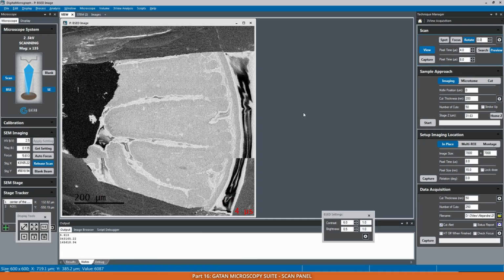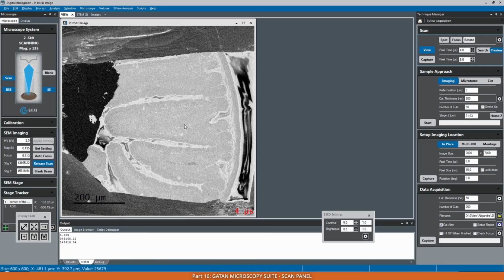The problem, however, is that sometimes with multi-ROIs, it may not really work super precisely. There is some bug sometimes triggered, so it can lose this rotation value. So just test before you actually do it for real.